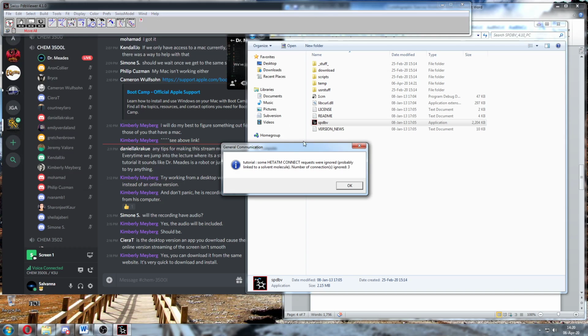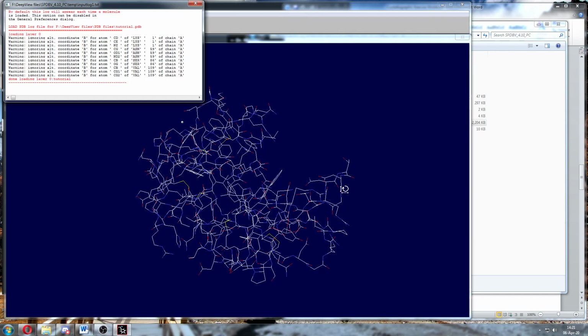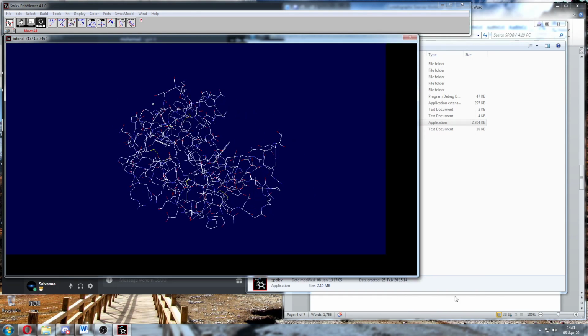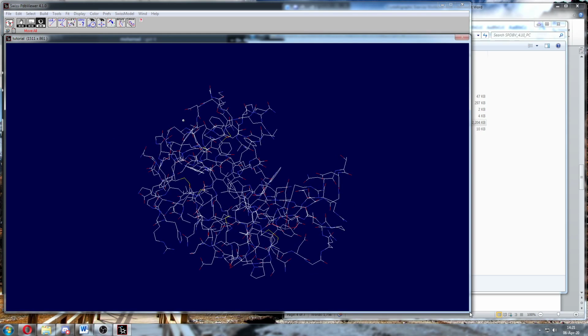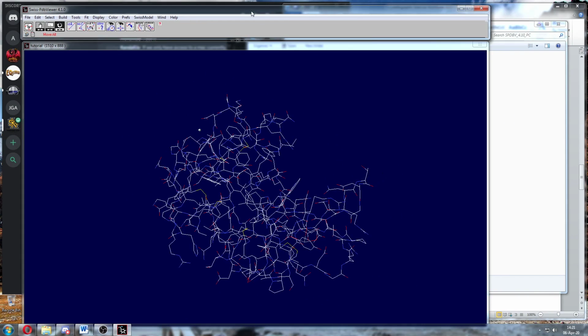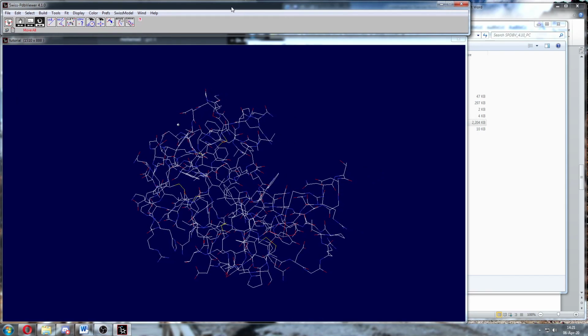You should get this warning box. Click OK, and it should open this. You can close this little window, right? And I want to scale this window, I can scale it any size I want, to match the one up top and fill most of my screen, right? And if I move it, it should move with the top window. Right, so I'm filling up most of my screen, so we get a nice big view. Leave some space on the right over here. We'll need it in a little while.